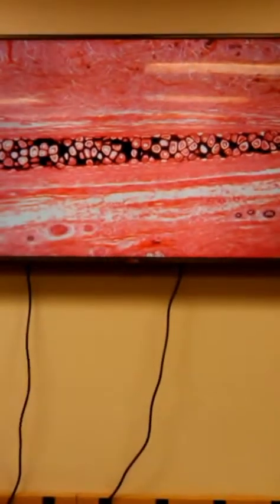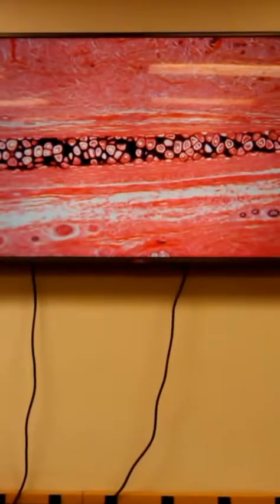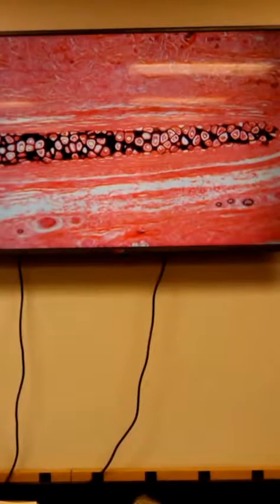That's about how clear we had it last week. Does it auto adjust like that? Yeah, well, you can see either way. I think it's pretty obvious. But, so that strip in the middle, it is high res, but you're not picking up the elastic fibers that you pick up in the scope here. So that black stuff would be all those thin proteins, the elastic fibers. And of course the chondrocytes in their lacuna, so elastic cartilage.